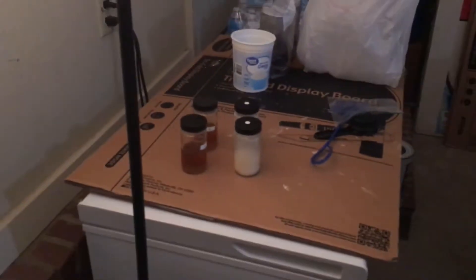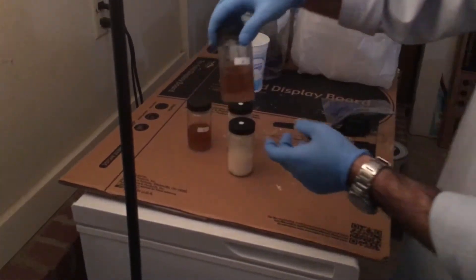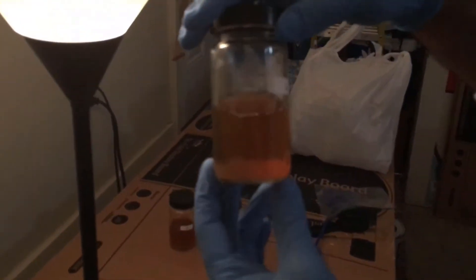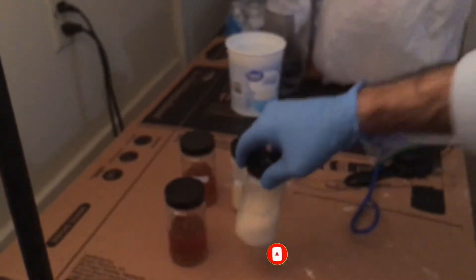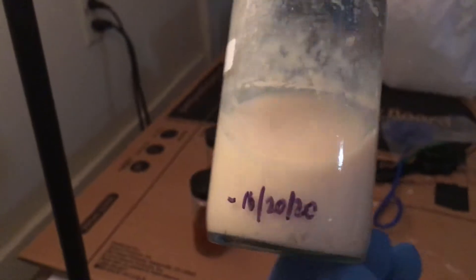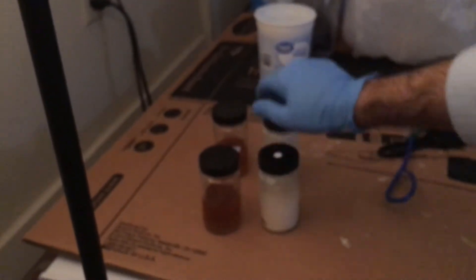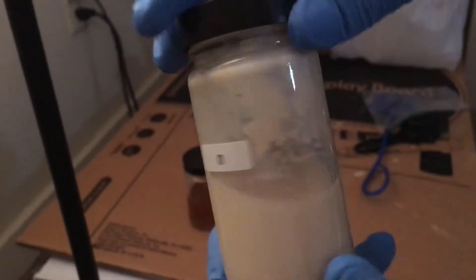As you can see here, we have a lot of microbes — there's a lot of microbes in the sugar water. Let me show you the second one — an exorbitant amount of microbes in the sugar water. For the milk ones, let's just say they're not doing so hot. We always lose them with the milk. Same thing here — they're looking kind of weak.